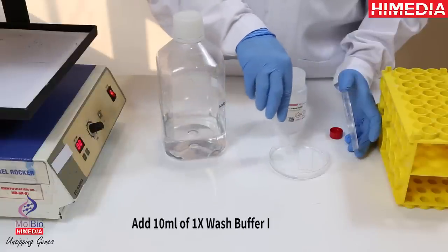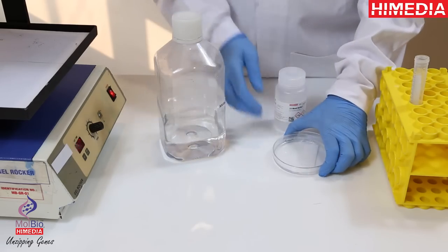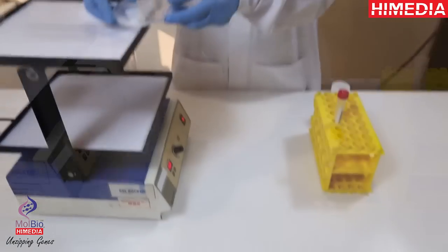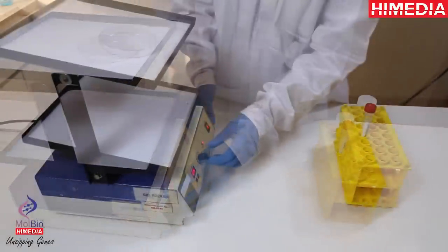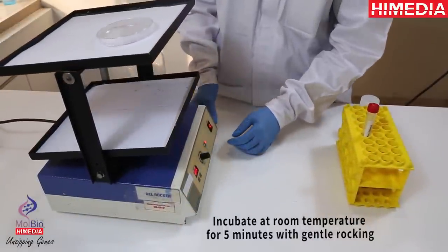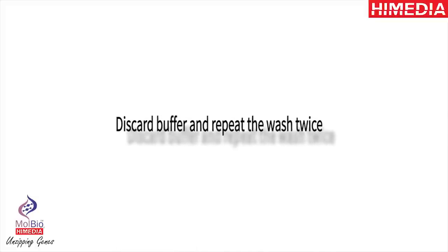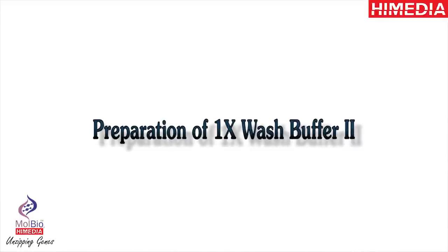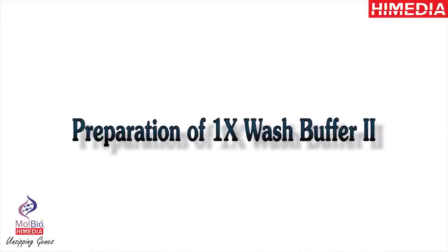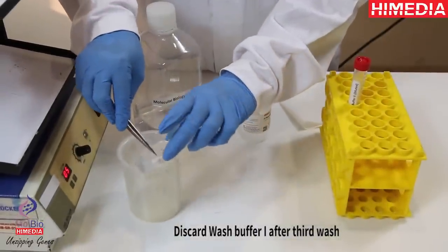Add 10 ml of 1X wash buffer 1. Incubate at room temperature for 5 minutes with gentle rocking. Discard wash buffer 1 after third wash.